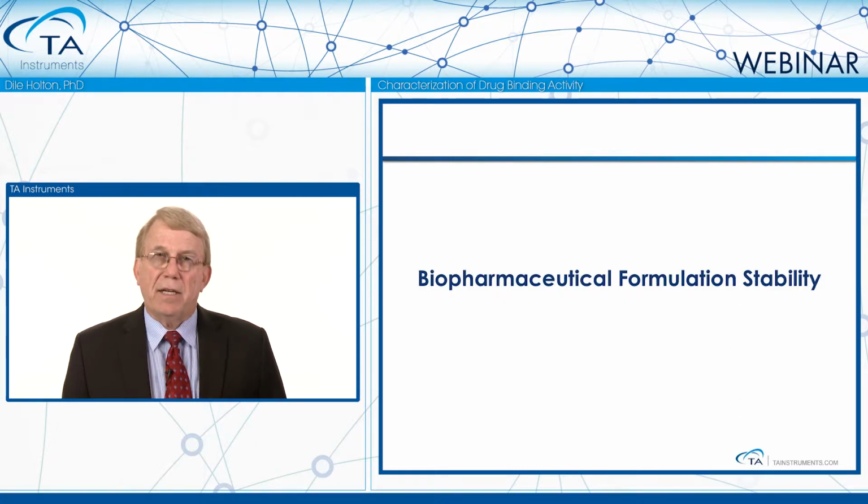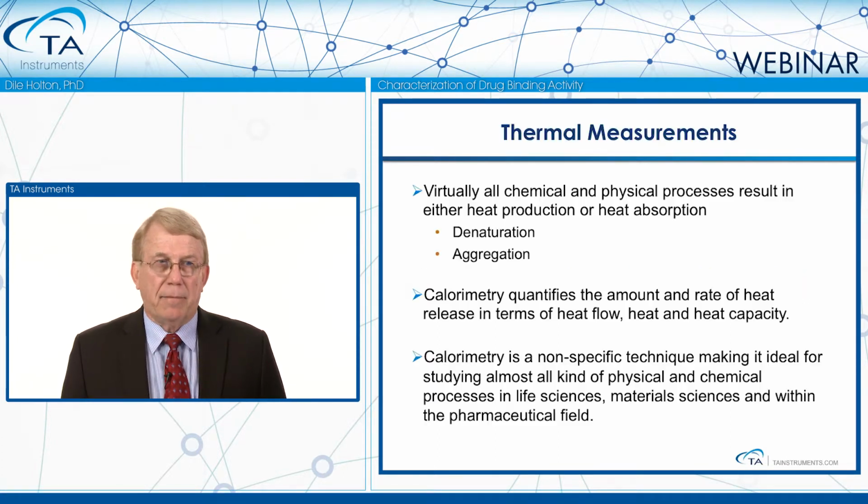The second set of data I'm going to talk about, once you've made that candidate selection and produced some of the biopharmaceutical, is formulation stability: how can I analyze that quickly and accurately without going through a full, sometimes multi-week, multi-month shelf life study?